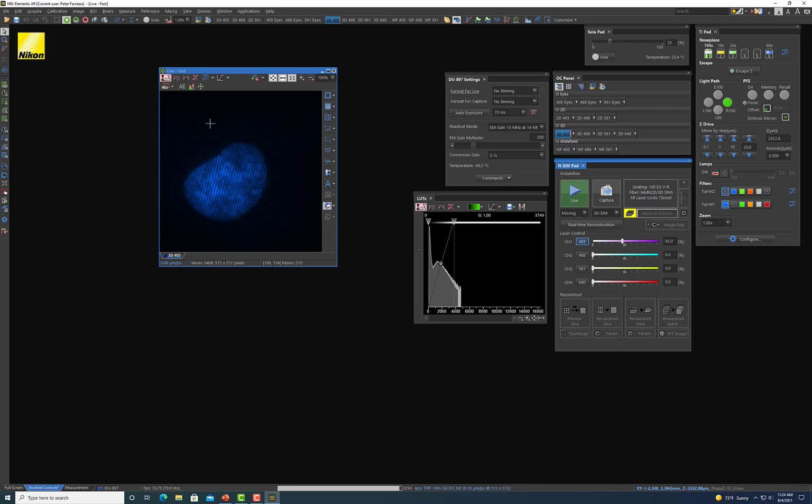I can see it offered a little bit of an improvement, so I'm going to go with that. And I'm going to now right-click on my optical configuration. You can either right-click here or here. They do the exact same thing. So right-click and assign current camera setting. And now my preset has been updated with the new laser power intensity.